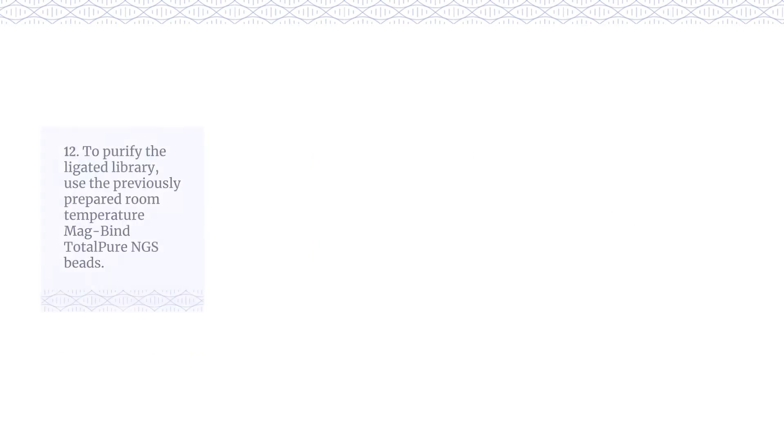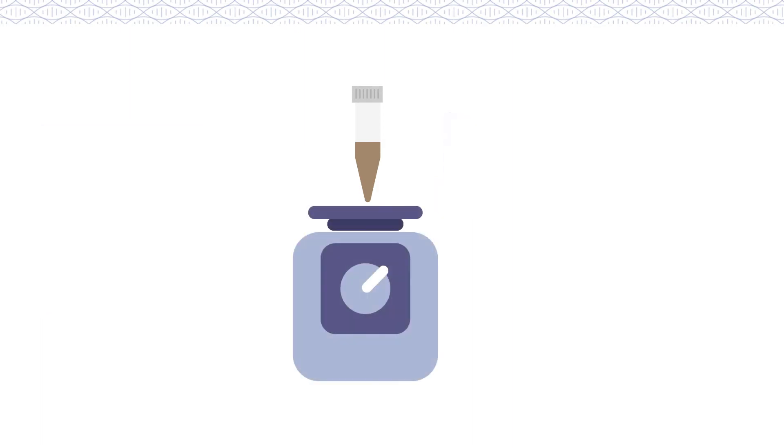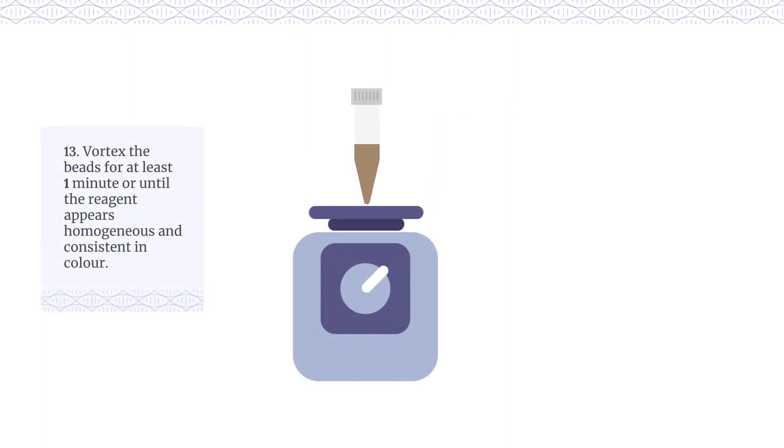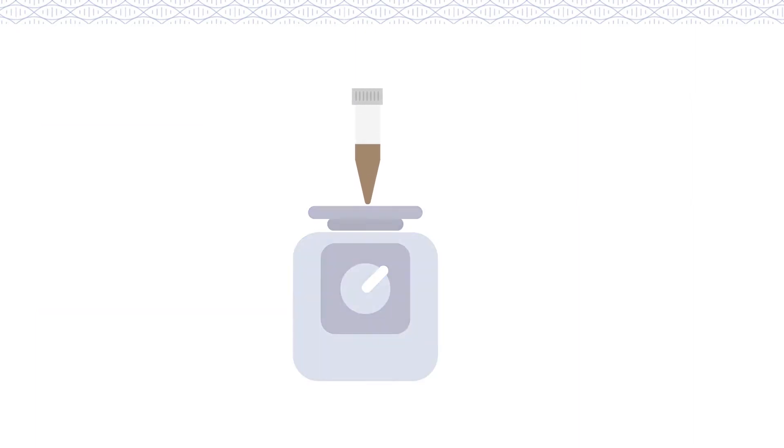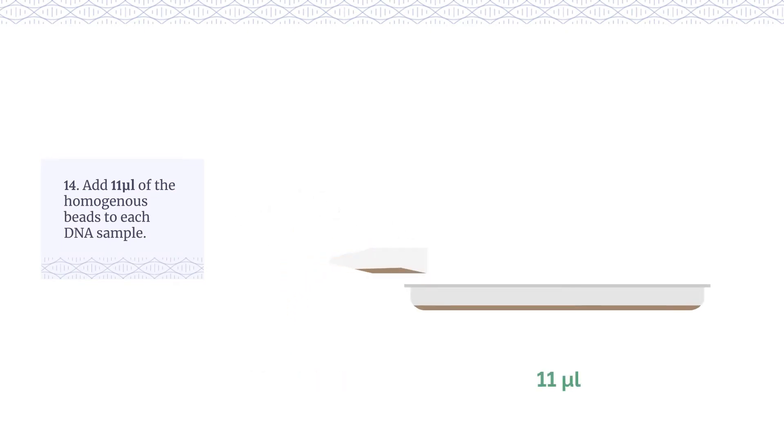To purify the ligated library, use the previously prepared room temperature MagBind TotalPure NGS beads. Vortex the beads for at least one minute or until the reagent appears homogenous and consistent in colour. Add 11 µL of the homogenous beads to each DNA sample.